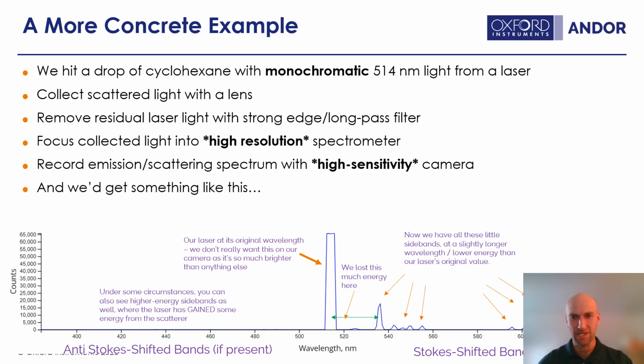I think scattering is probably more technically correct. We record it with a high sensitivity camera because you need one for such a weak process. Generally you can't use an inexpensive webcam, and even the nice camera on the iPhone, I think, would have some trouble with it because it's not cooled, to my knowledge. So you'd have quite a bit of dark current there. We'll talk maybe about camera parameters tomorrow, I believe, or during the next episode.